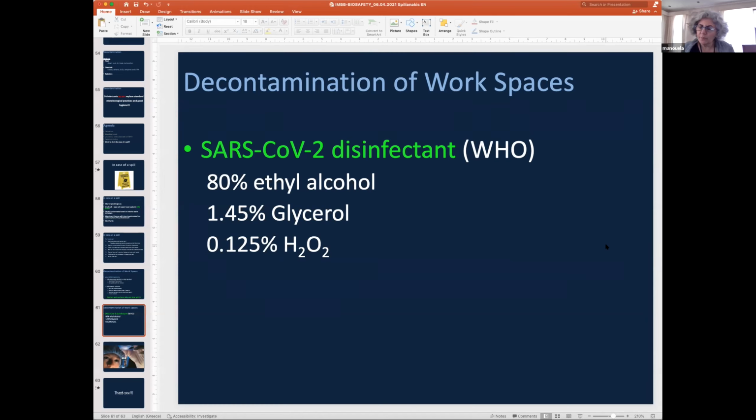A question from Manuela. How do we dispose of vials and pipettes that contain human blood? They should go to the containers that are found in the tissue culture room, because these have blue bags. In the US they were red.